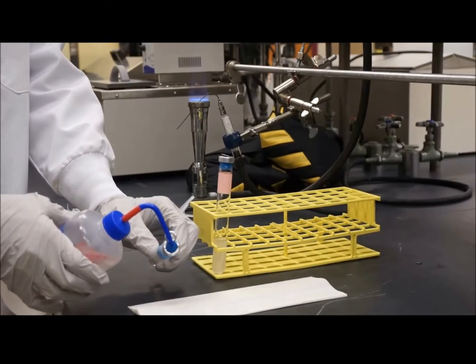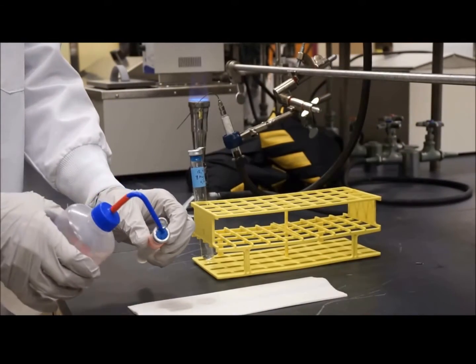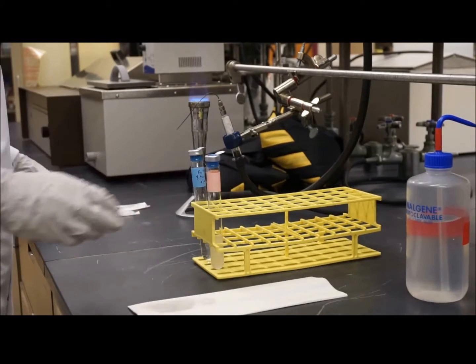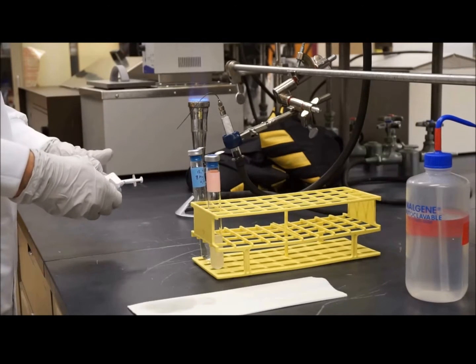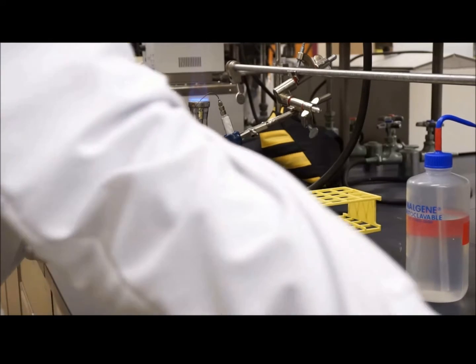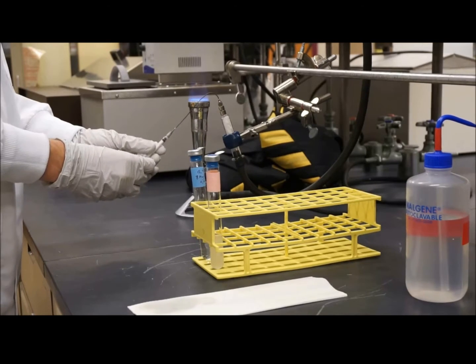We sterilize the rubber stoppers of the tube by spraying them with 70% ethanol and igniting the ethanol with a Bunsen burner. We do this for both tubes. Now we're ready for our syringe. We attach a needle to the syringe aseptically. In order to flush out trace amounts of residual air, we must flush out the syringe with CO2 by inserting into the gassing probe and pulling the plunger in and out.